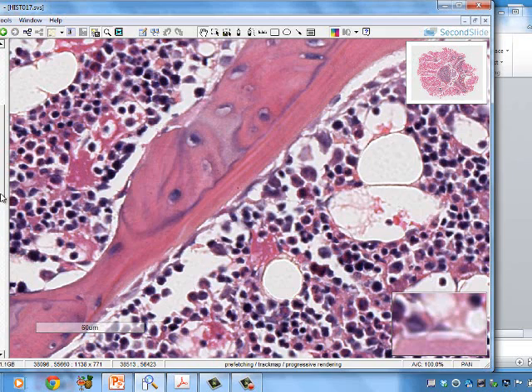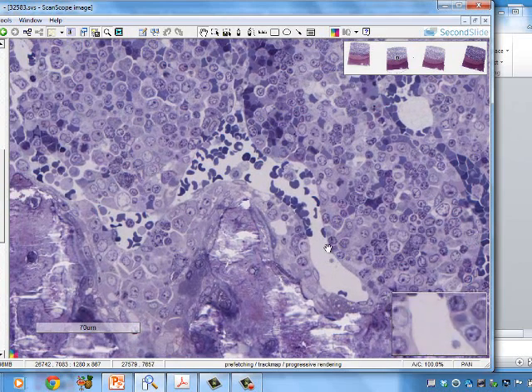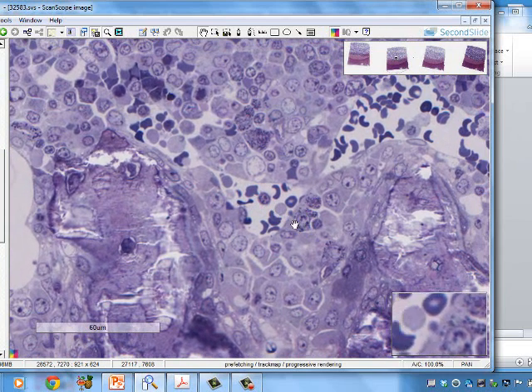So if we take a look at that, anyhow, here we can see there's a blood vessel right in through there. There's another neutrophil, a different one, another white blood cell. These are red blood cells. This one is a lymphocyte that's in the blood itself, as opposed to these granules here, and there, and there.